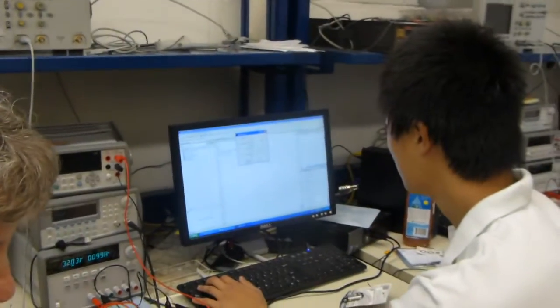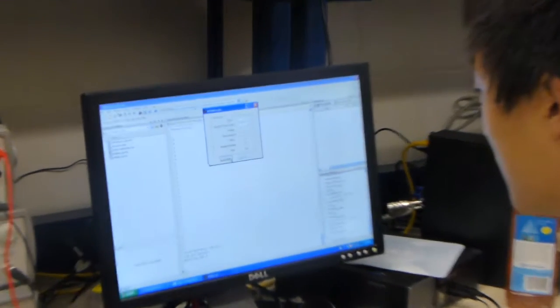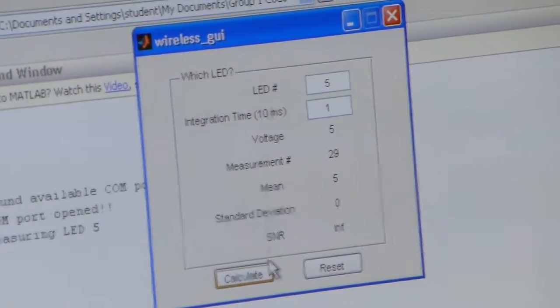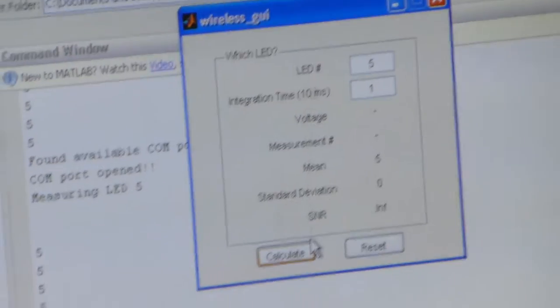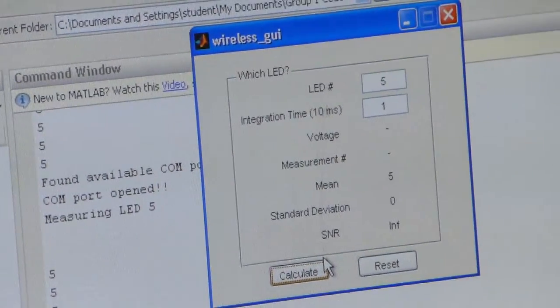Three. Four. And then it spits out your voltage, your measurement, your mean, standard deviation, SNR.